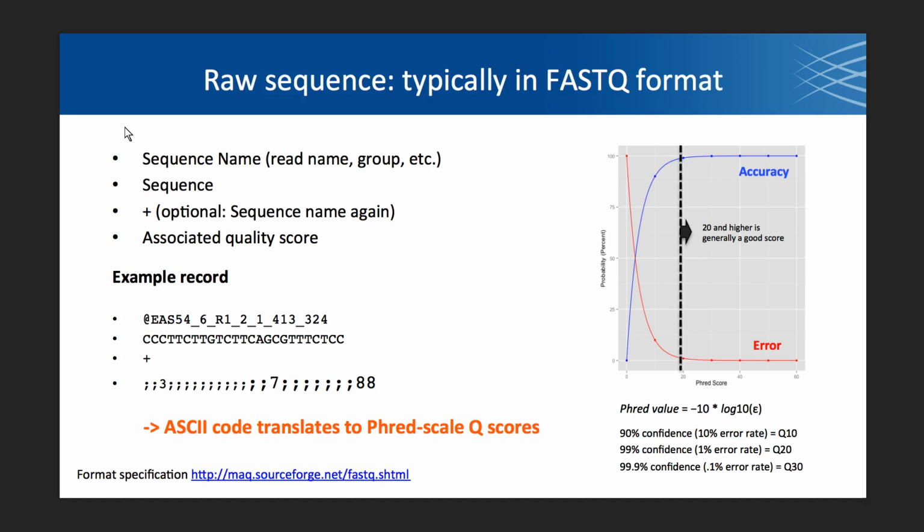I'm going to give you 20 bases. If all of them are Q10, then 2 of them are wrong. That's not really good, right? So Q10 is not that great. Q20 is starting to be reasonable, right? So Q20, what does that mean? It means 1% error, right? So if this is 20, minus 20 over 10 is minus 2, so epsilon is 0.01, right? Epsilon is 0.01. That means log base 10 of epsilon is minus 2. Yes? All right. And then Q30 is 1 in 1,000, right?